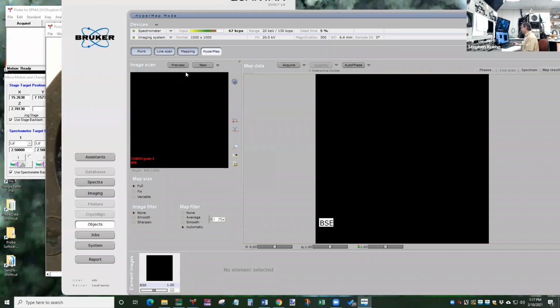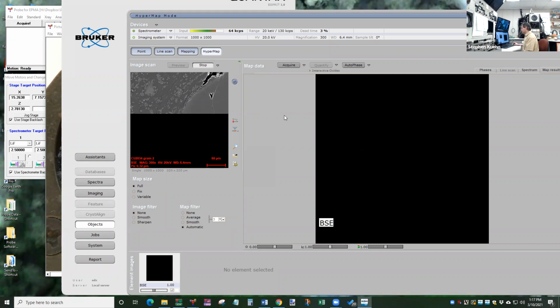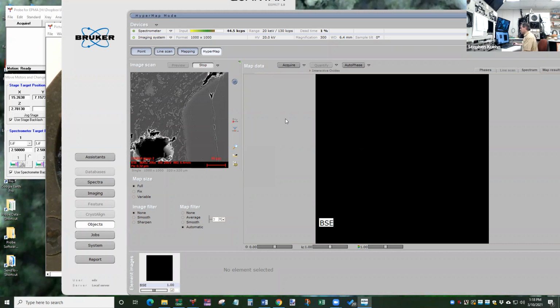And I'll just have it take a snapshot. I may not necessarily have to do this one. I just want to make sure the software isn't going to complain about something else later. All right, let me see. Actually, I'm going to turn off one other thing.